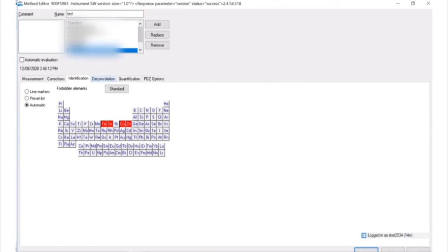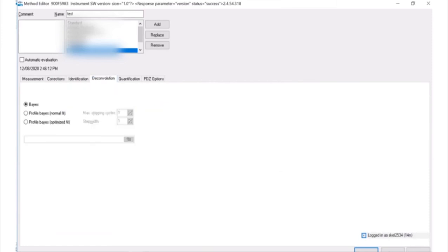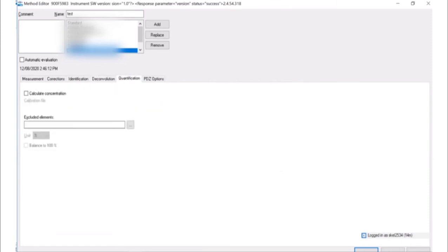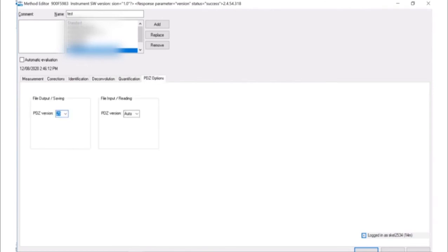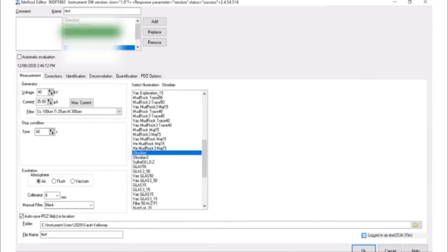Leave the PDZ option tab and deconvolution tab as is, with Bayes selected and the quantification tab as is, unless you have a prepared calibration to use. Once finished selecting parameters, click OK.